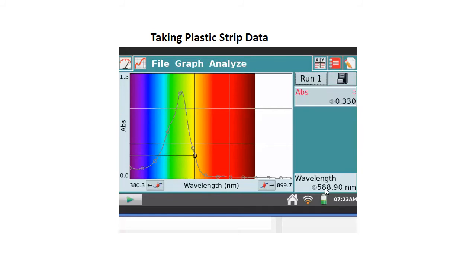So that's good. What you might want to do with this too is for each person in your group, they need to have one printout of one of the colors of this spectrum, because they'll answer a question later on about it. You don't need to print these out every time, but if you all want to print 3 of these right now, that's fine. Somebody wants pink and somebody has yellow as their favorite color, however you want to do it, but you need one copy of one of these in your group. And so we've got that in, and we're all set to go, starting to record data.